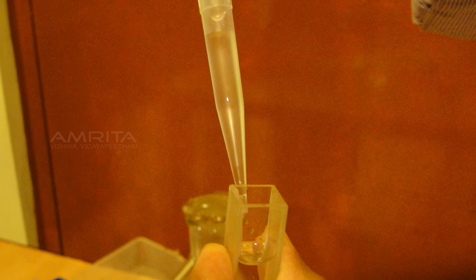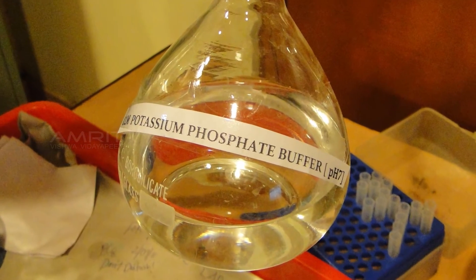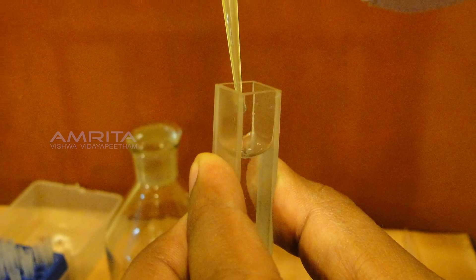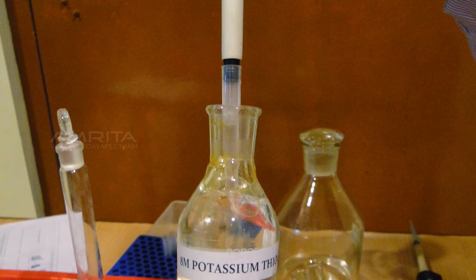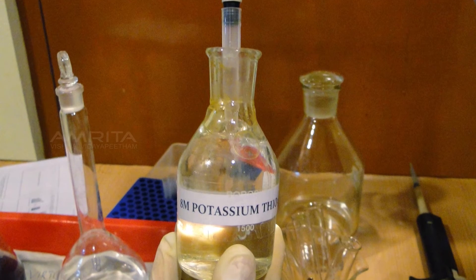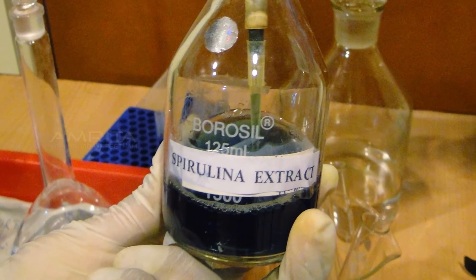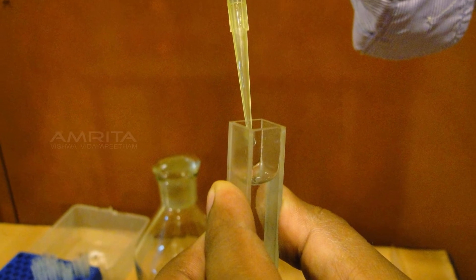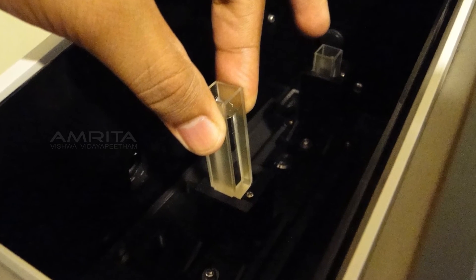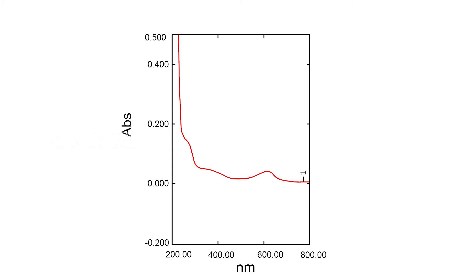The solution is discarded and the cuvette is washed and dried. Now take 1.5ml potassium phosphate buffer in the cuvette, then add 1.5ml of 8M potassium thiocyanate as the denaturant. Finally add 100µL protein solution and mix well using a pipette. Place the cuvettes in the UV spectrometer slots and record the spectrum at 625 nm.